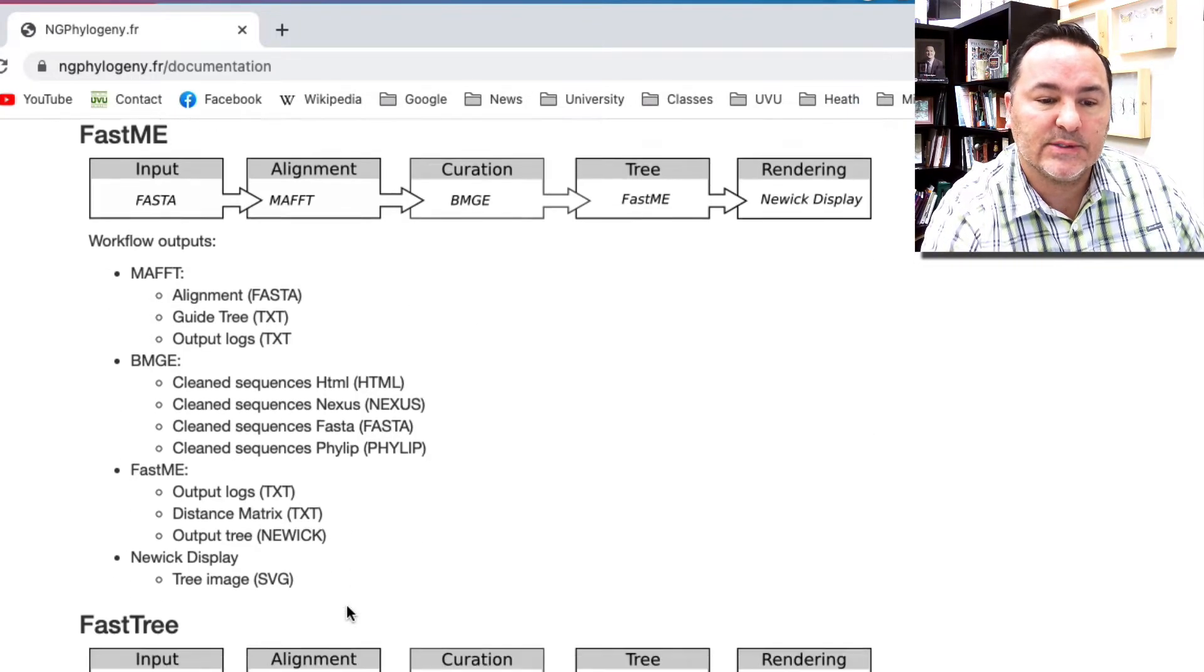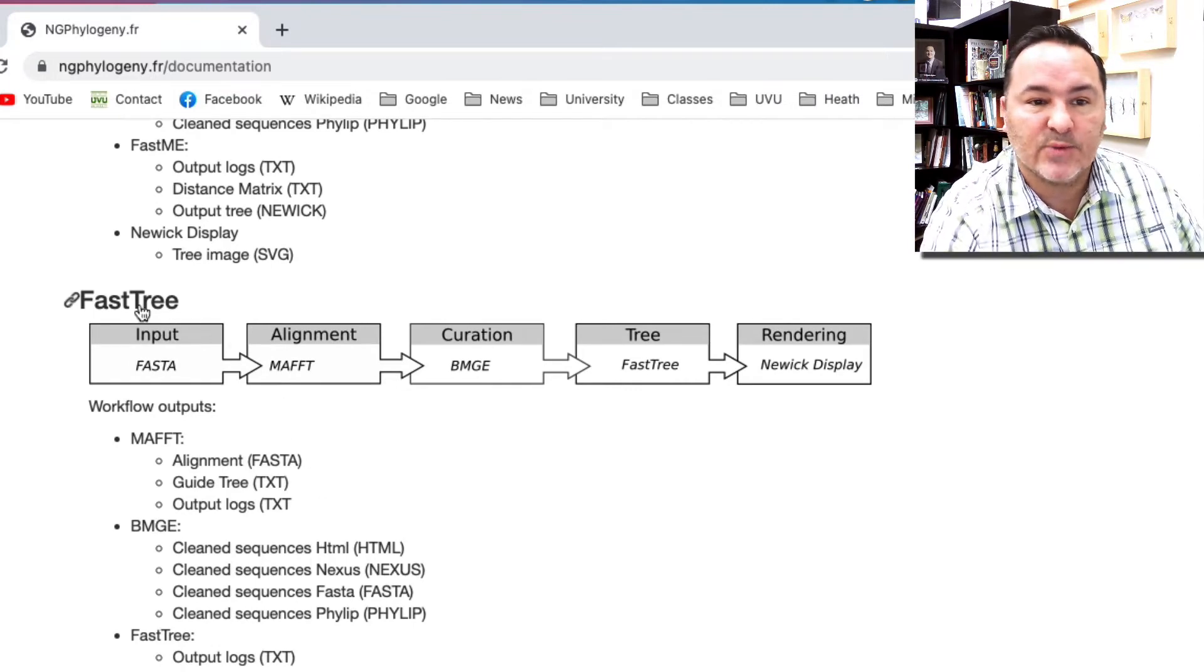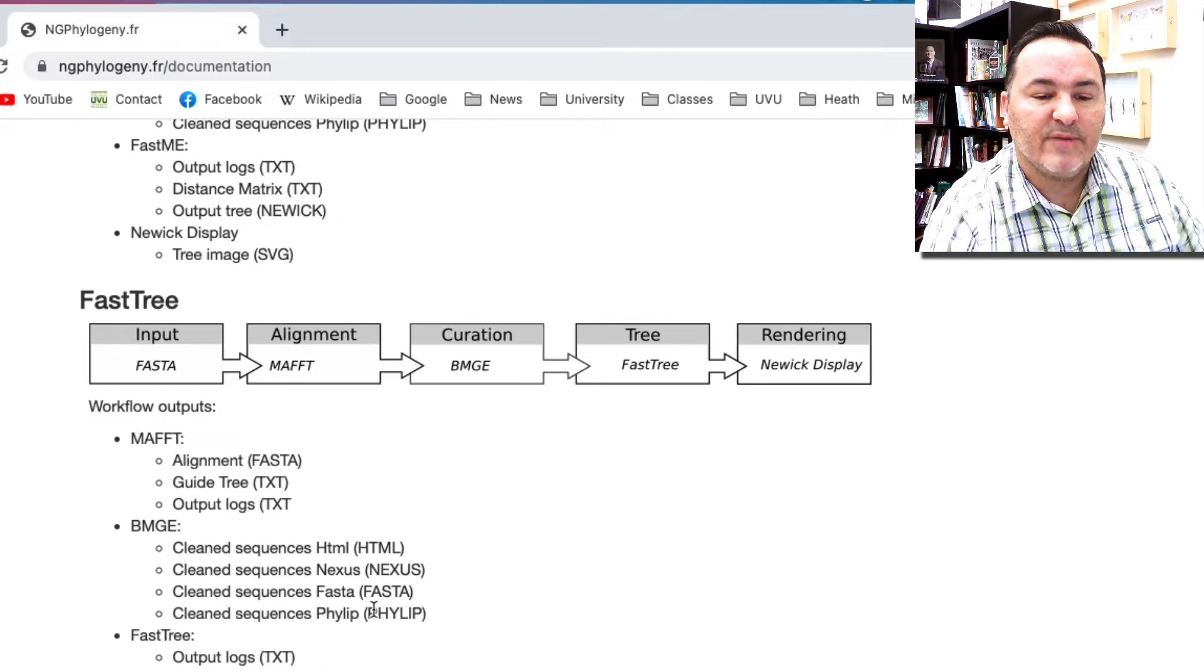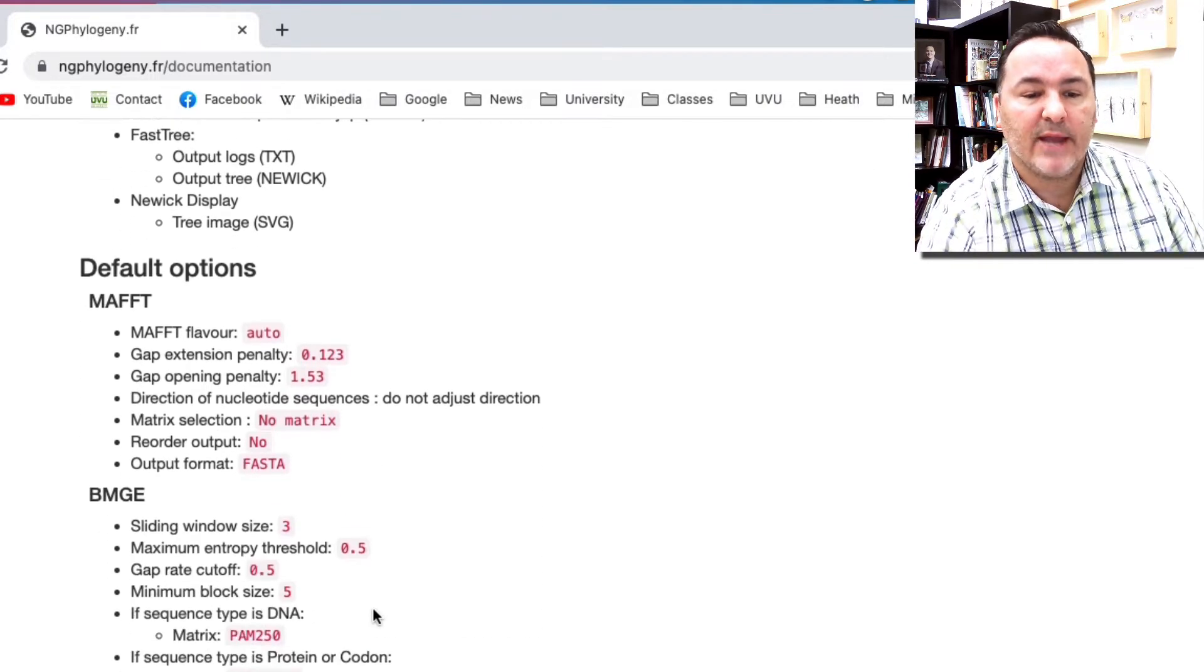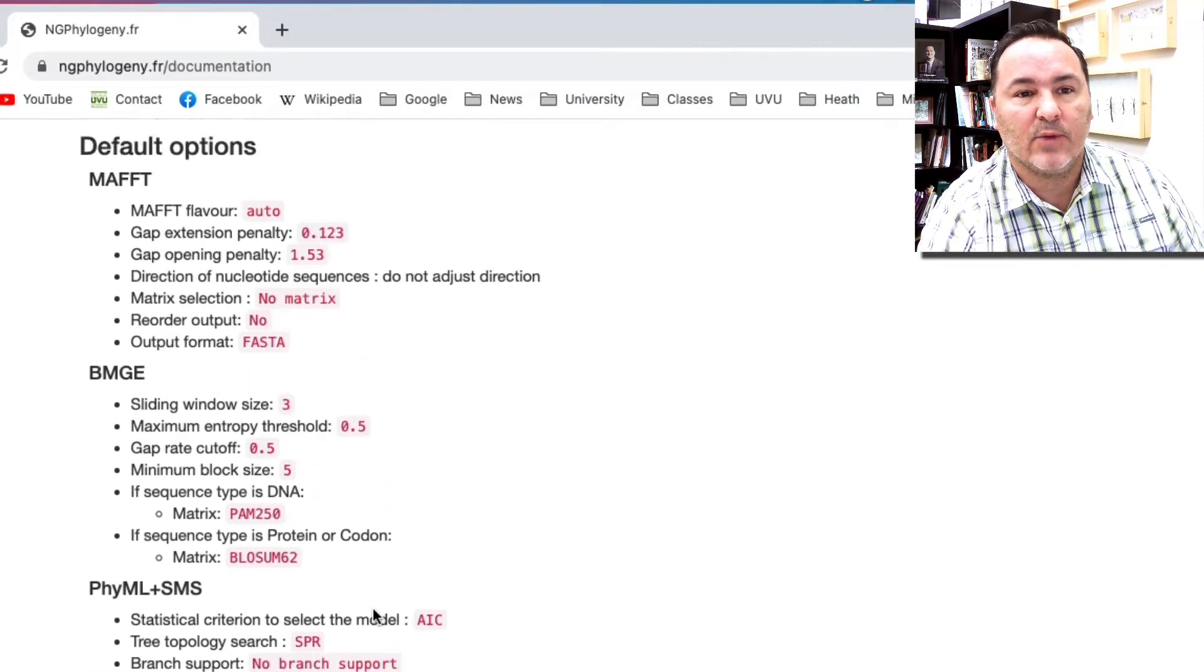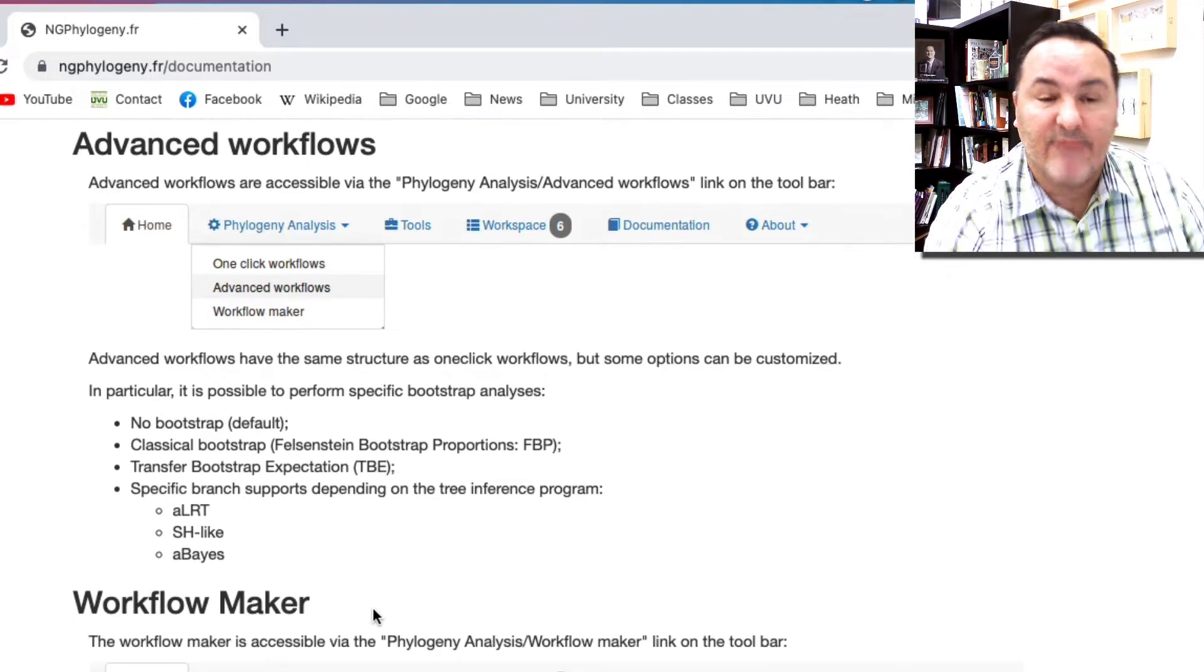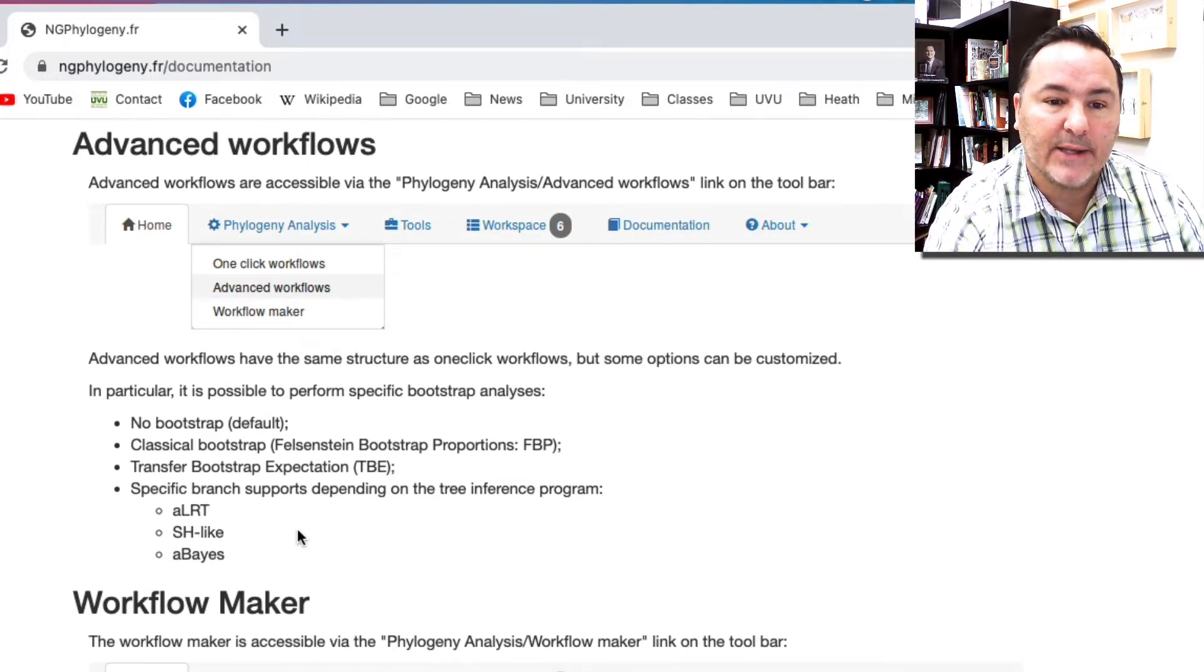You could read through these other ones. One that you can do that's kind of nice with larger data sets would be the FastTree one. But if you want to get more complicated, then you need to add extra things. It does tell what all of the default options are, but you need to go to the advanced workflows if you want to do something that's a little bit more complicated.